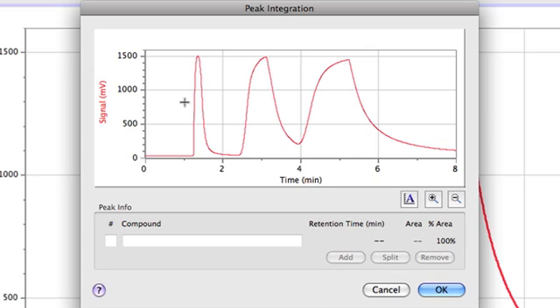All that I need to do to analyze each peak is to place my cursor on one end of the peak, hold my clicker down, and drag across the peak to get the region that I want to analyze. And then below that graph in my dialog box, I click add. It does two things instantly. It determines the retention time for that substance and it calculates the integral, so I now have a peak area. I am given a generic label. It tells me that this is peak one. I can change that if I happen to know exactly what the substance is, but I'm going to leave it at peak one right now.